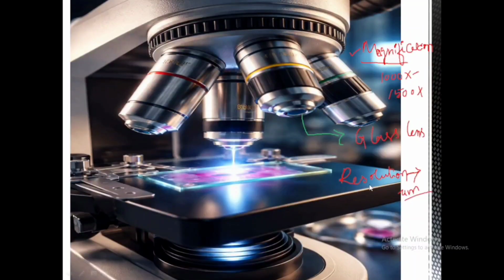The next difference is resolution. The light microscope resolution is good, but the electron microscope resolution is the best. Why? Because the light rays have a longer wavelength. The light rays wavelength is like 400 to 700 nanometers, and a longer wavelength gives less resolution.